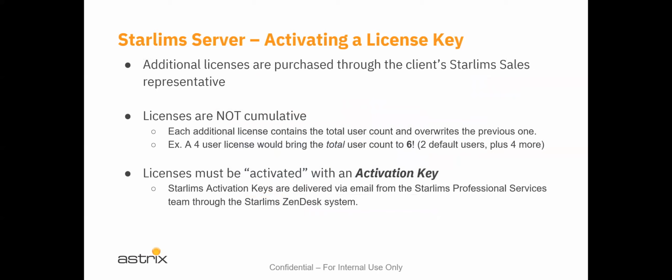Additional licenses are purchased through the client's particular STARLIMS sales representative. That's not something that we do as consultants. We might inform the client that, hey, by the way, we need more licenses for the additional users you have. And the issue is that STARLIMS only issues access to their sales team and or what's called a Zendesk system. We're going to introduce that system to you. And the Zendesk system is the STARLIMS support system, essentially.